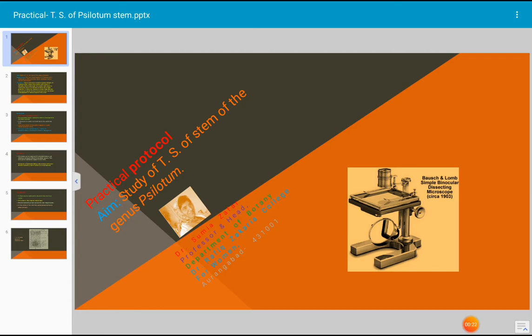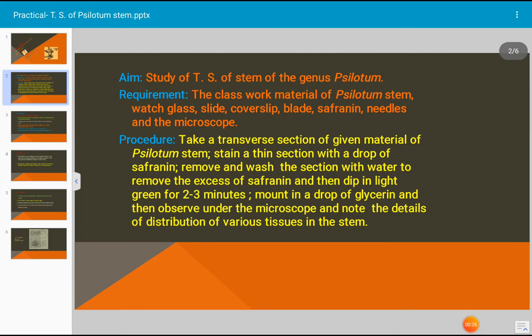Let us see the internal structure of stem of Psilotum. For the practical, the requirement is we need class work material of Psilotum stem, watch glass, slide, cover slip, blade, safranin, needles, and microscope. This is the requirement of practical.